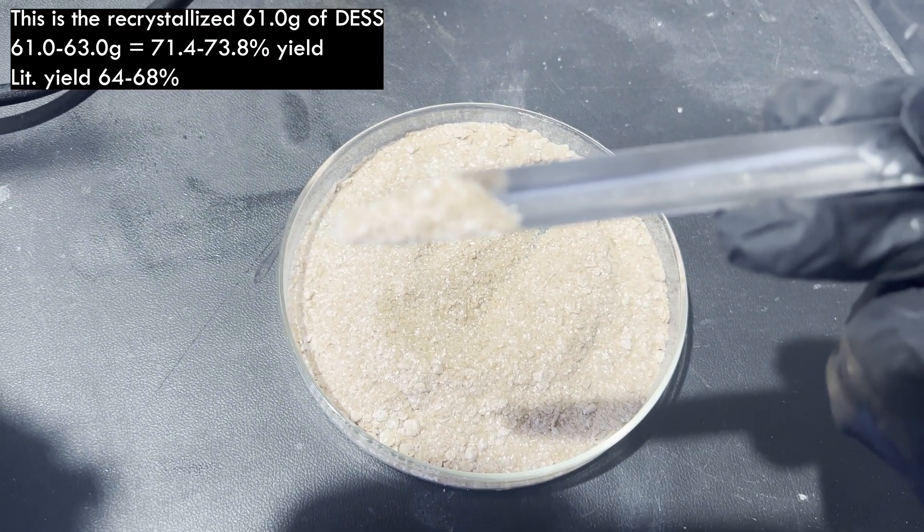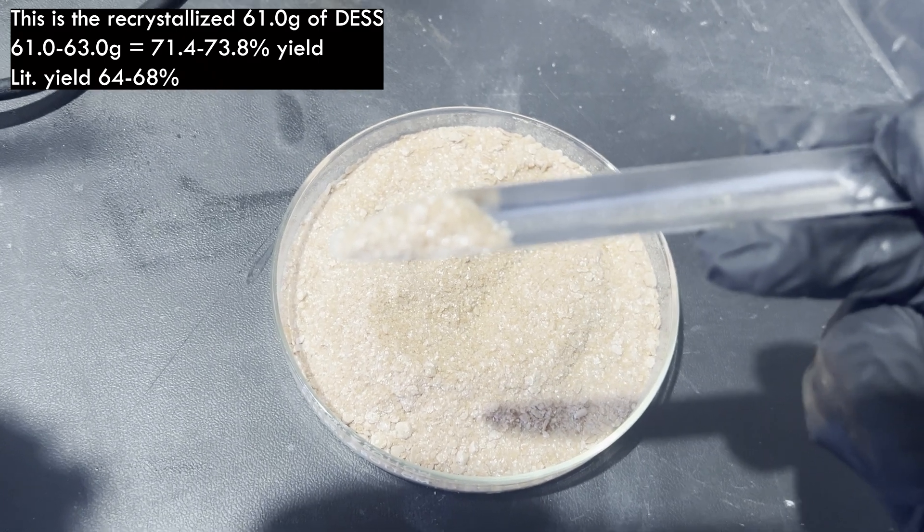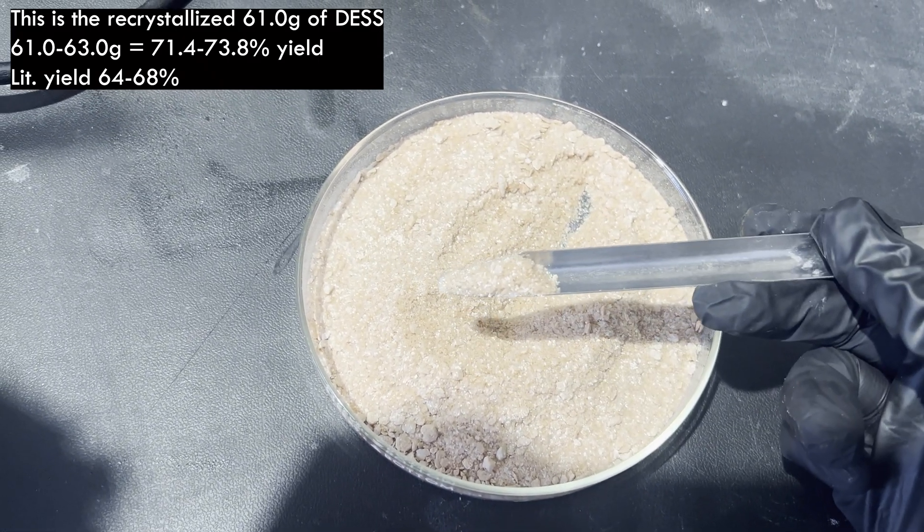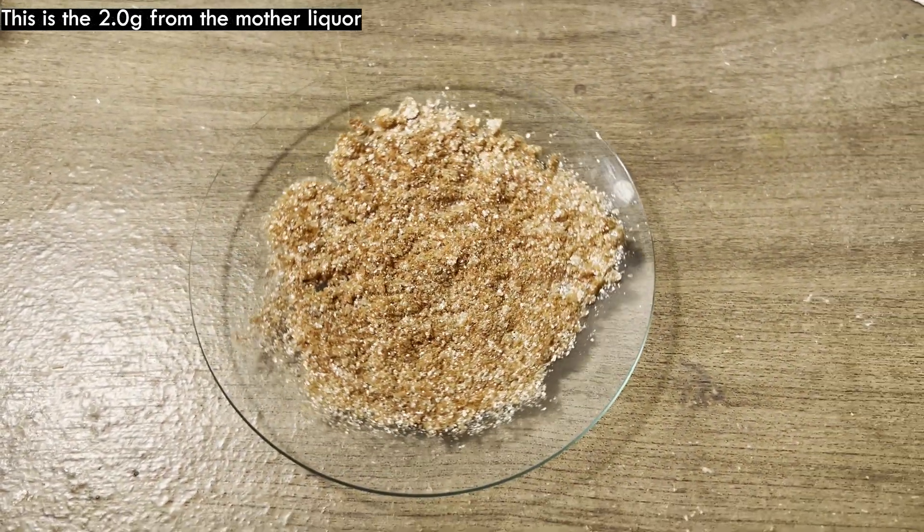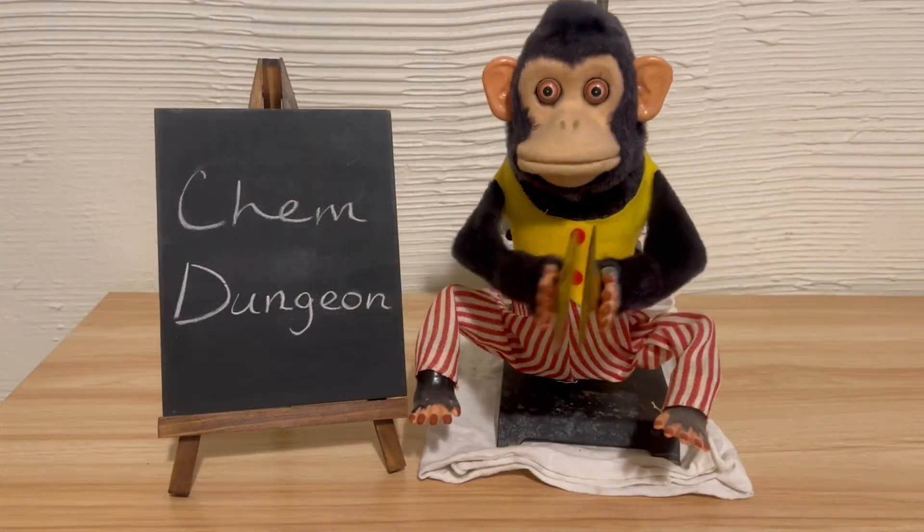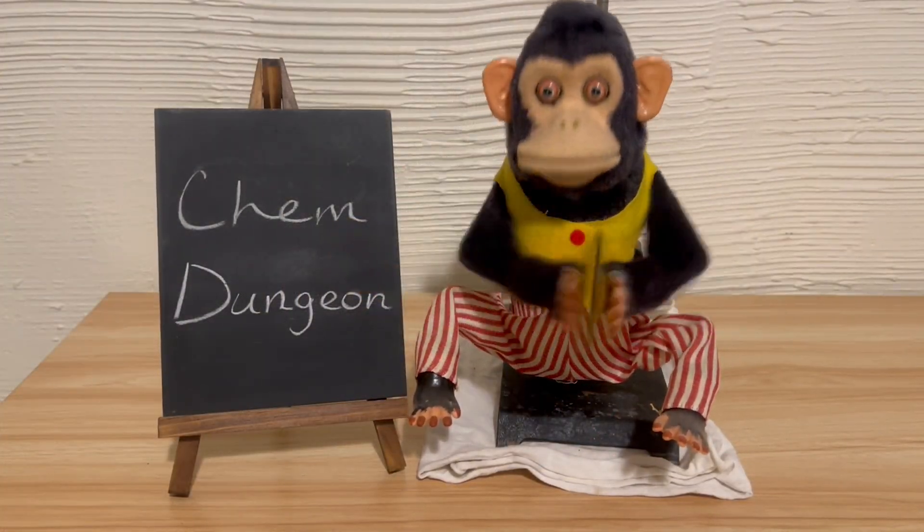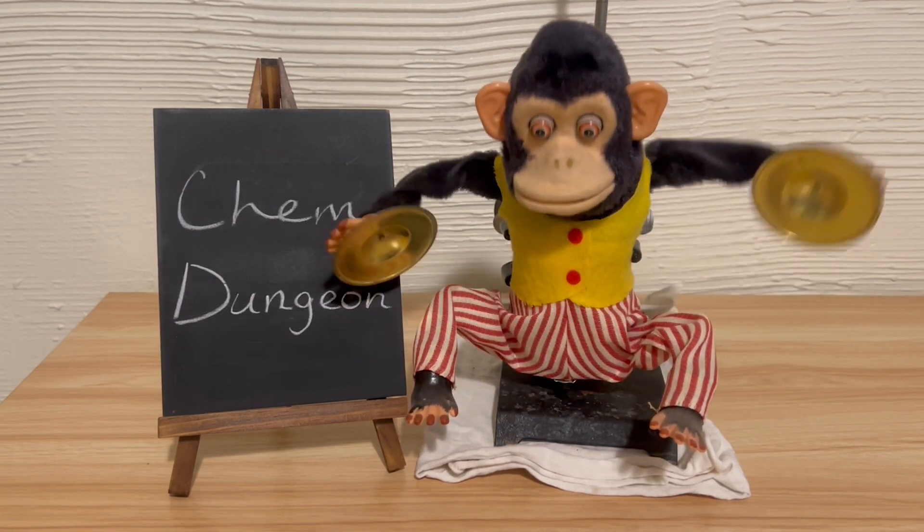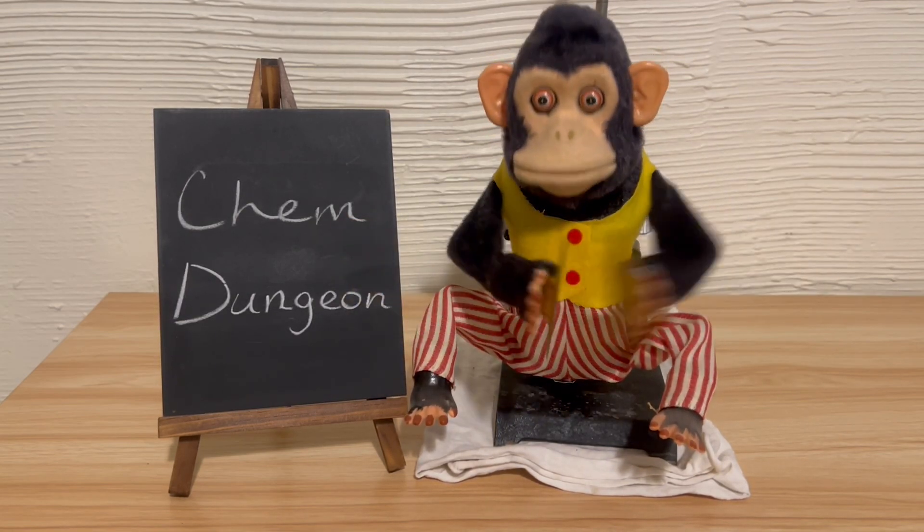And I could do a second recrystallization, adding activated carbon to it and filtering it hot again to remove the remaining colored impurities, but because the melting point is what it is, I didn't think it was all that necessary. If, after using it in the next synthesis for quinacridone, the yield is terrible, or something else goes horribly wrong that can't be anything other than the DESS, I will recrystallize it and do that, and of course I'll include that in the video.